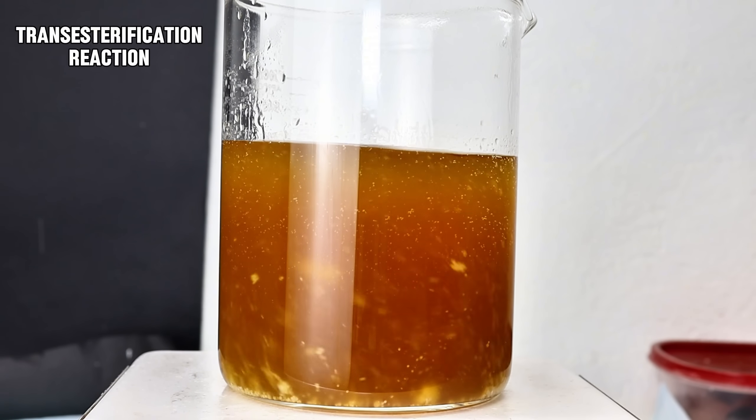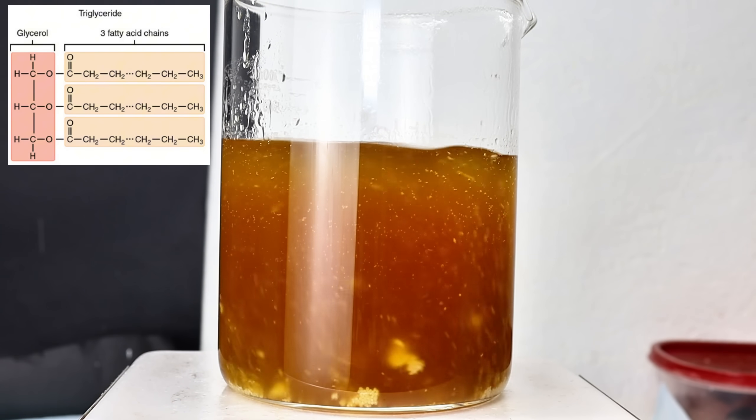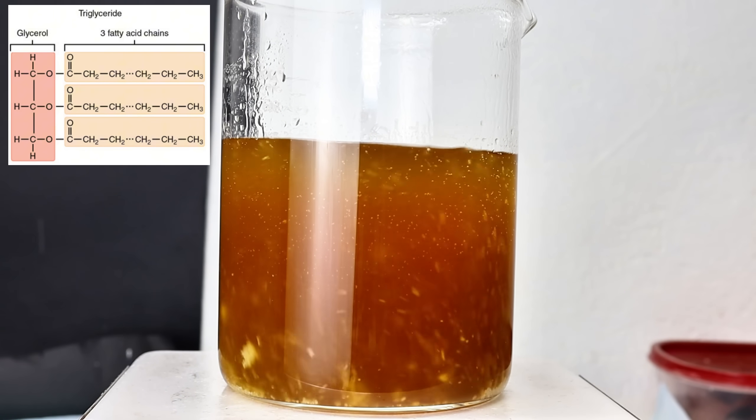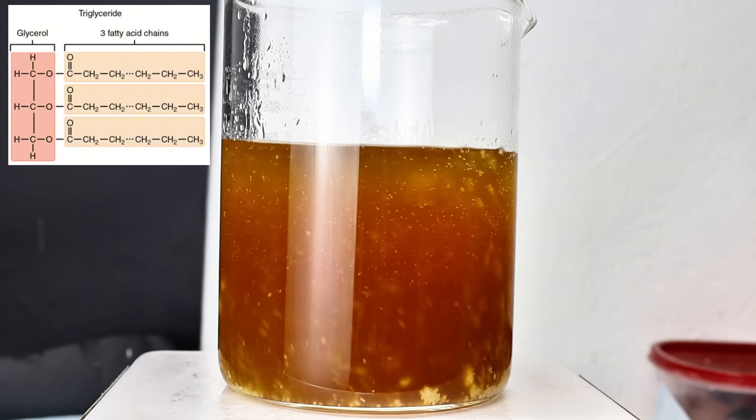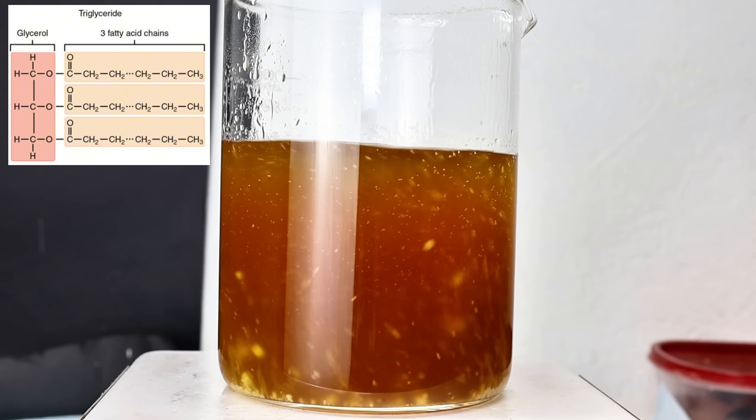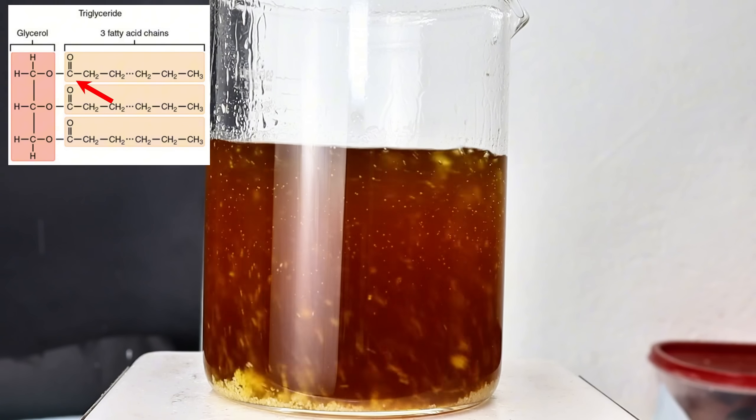Oils and fats are composed primarily of molecules called triglycerides, which are further composed of three fatty acids bound to glycerol. In this transesterification reaction, the sodium methoxide attacks the carbonyl here, forming an unstable tetrahedral intermediate.